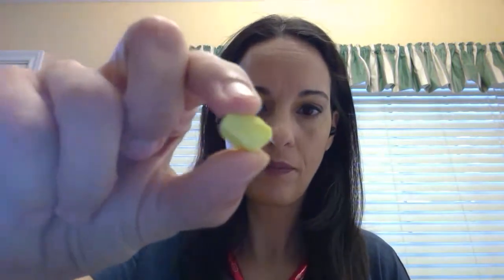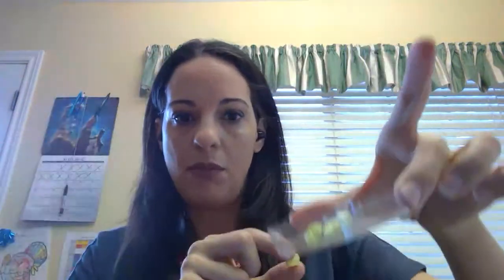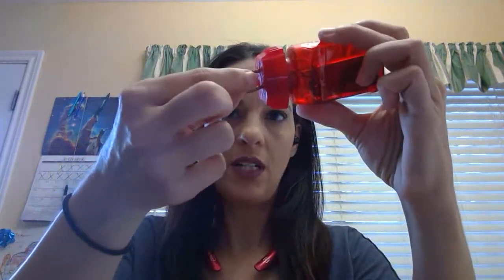Okay, here is element number 3. You can see that it is not reflective, it is dull. And then I can tell again from the jagged edges from this and from the pieces in my Petri dish that if I took a hammer to this, it would break into pieces. And if I use my conductivity tester, it does not light up. Okay, fill out your chart for element number 3.